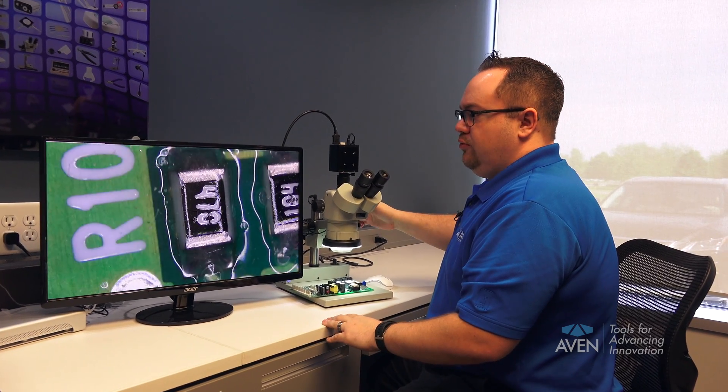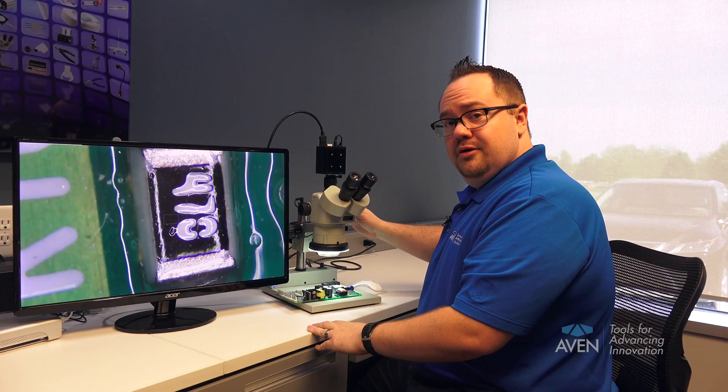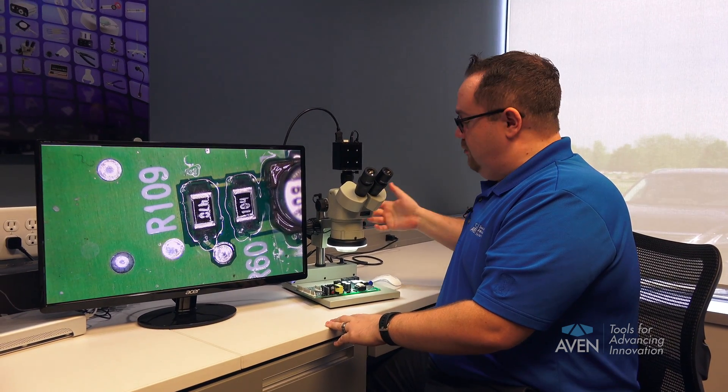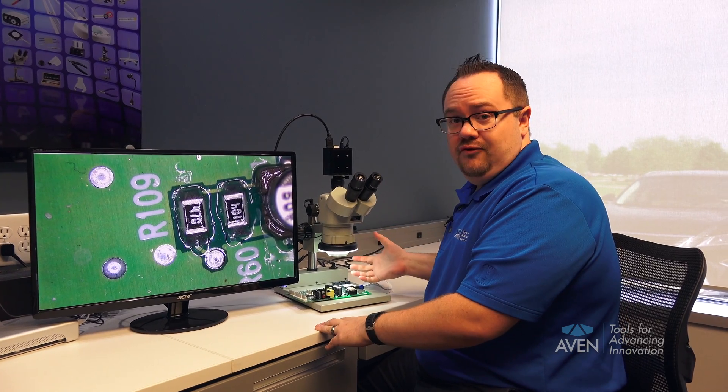Now, as you zoom all the way through, both the camera and the eyepieces are in focus all the way through the dynamic range without having to move the objective up and down — and that's how you parfocal a stereo microscope.